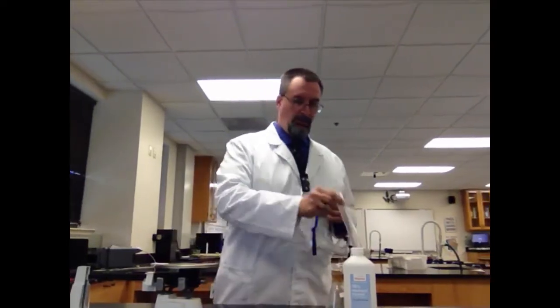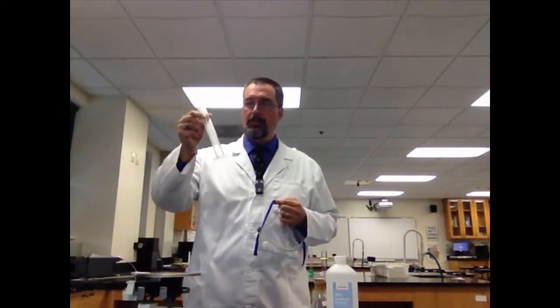So the process for determining the density of a liquid is similar, but with one important difference. We can measure the volume of a liquid directly, but the mass of the liquid has to be done in a particular way. And so I'm going to show you how to do the mass of the liquid right now. Start with your safety goggles, of course.